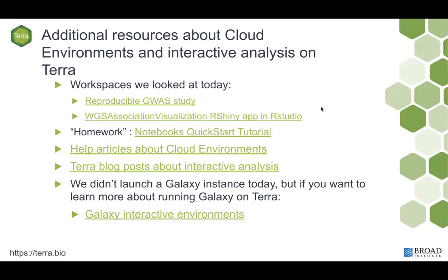Is there any plan to do a GATK on Terra tutorial workshop? Derek, would you like to cover that? So we actually have registration open for a structural variant discovery pipeline in Terra workshop that's upcoming. It's on February 13th. If you give me a second, I will find the link. It's live and in person though.